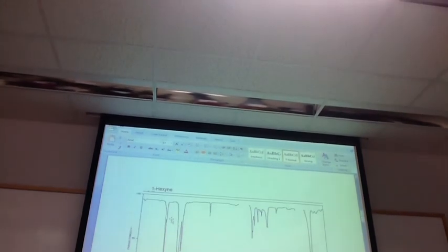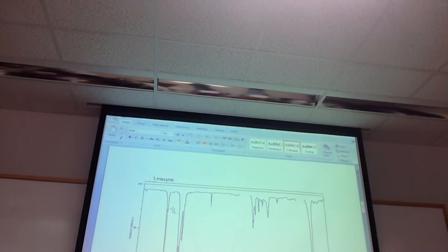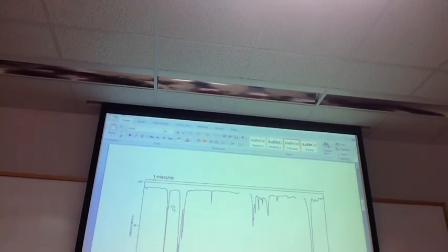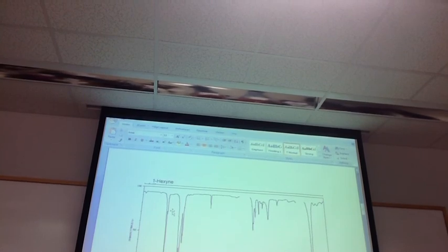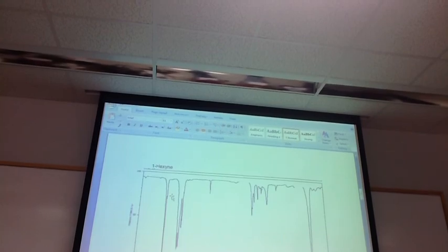I don't know. She kind of threw me off. Yeah, she said something over here. I keep getting mixed up with alkene, alkyne. I know alkane, A-N-E. Yeah, I understand that one. Look at your peak and where each stretch comes in.